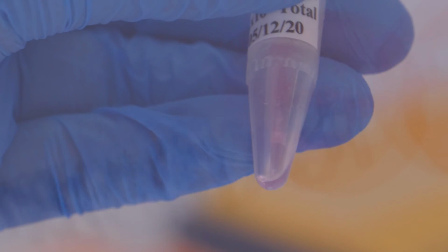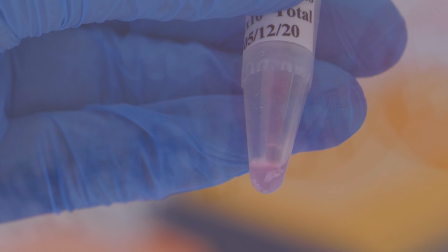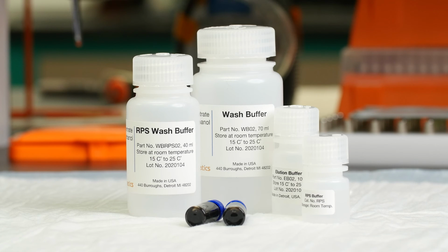Third-party lysis buffers will typically require calcium chloride to be added like we did here. Some lysis buffers that contain a lot of chelating agents may not be compatible. For instance, Trizol is compatible, but Trizol LS is not. Lysis buffers provided by Life Magnetics may already contain calcium chloride, in which case you can skip adding RPS.